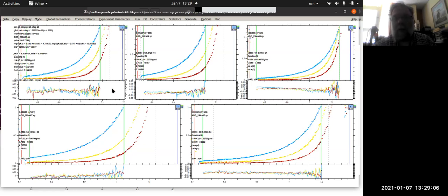So you have to be justified, and somehow you have to have some other information that leads you to believe that there truly is this heteroassociation actually happening before you get into this kind of modeling. So does that make sense to everyone?